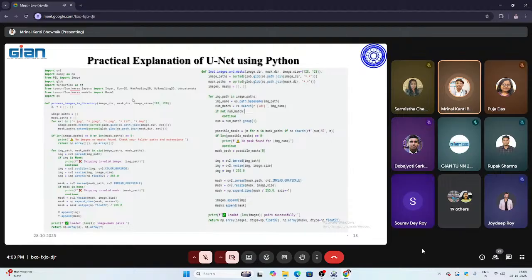Because the binary masks, as in the earlier lecture you have seen, have been developed and saved in two formats, either PNG or .bmp files. So the ground truth and the images have to consider all the image extensions available: .jpg, .jpeg, .png, .tif, .bmp have been considered, and then sorted. These two lines indicate whether the images are present in that particular directory or not.